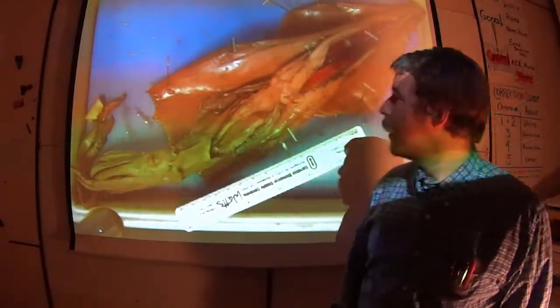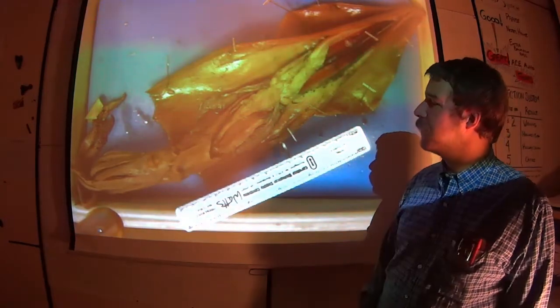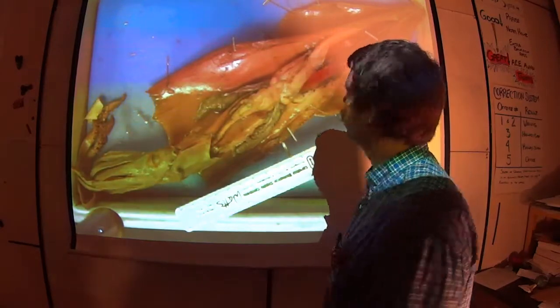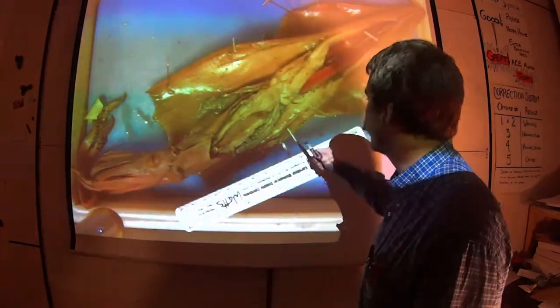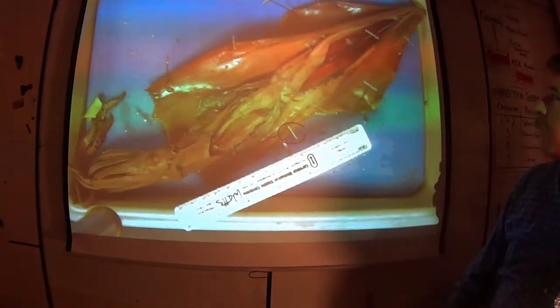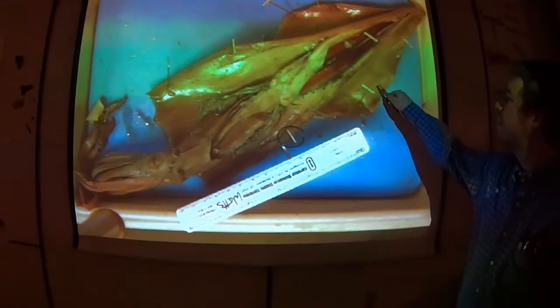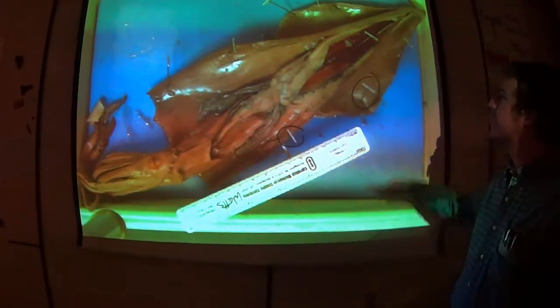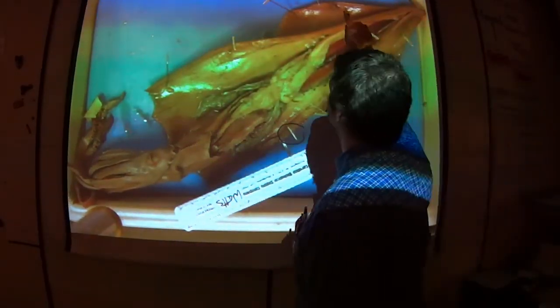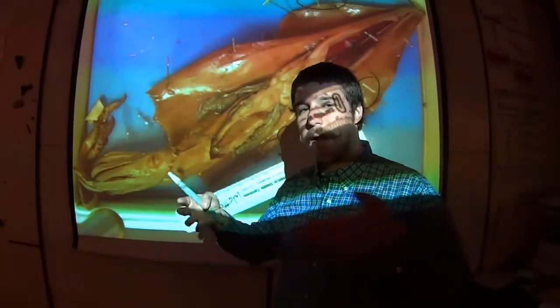You open it up and it should look like this. The cut is pretty straightforward. Just have it with the siphon side up and make your cut straight up to the top using the scissors. Then use the pins here to get a good pinning of the mantle out of the way. You need to make sure this pin in there not so good. This pin, I'm not even sure why that one's there. This one though looks pretty good like this.